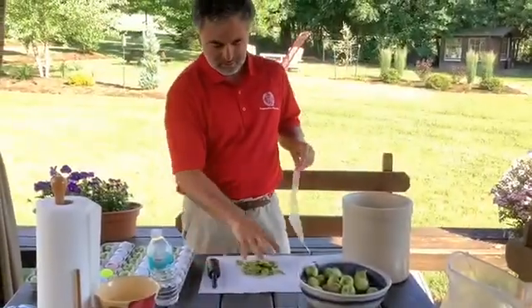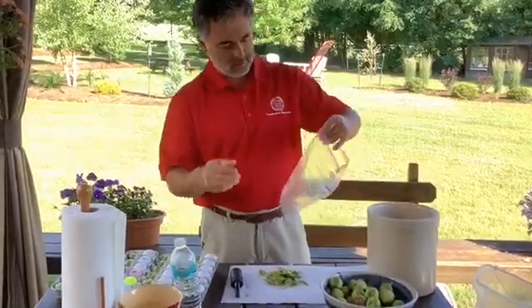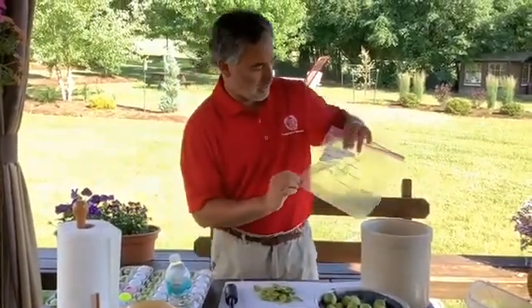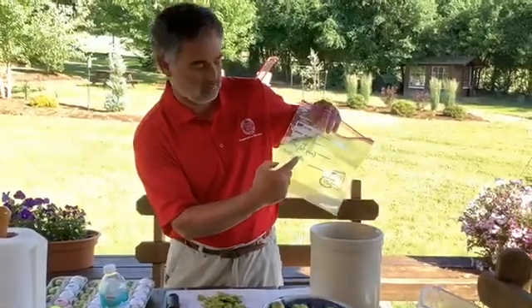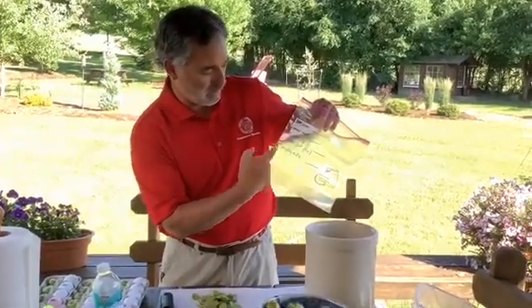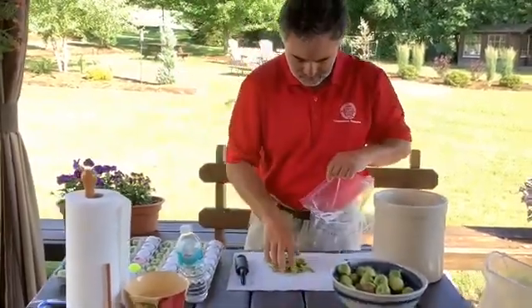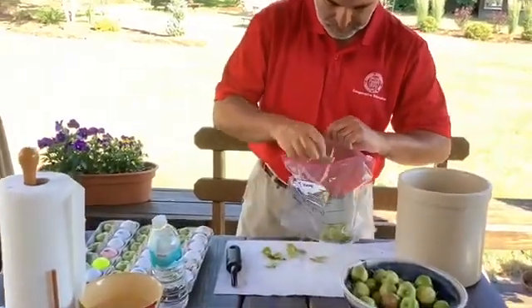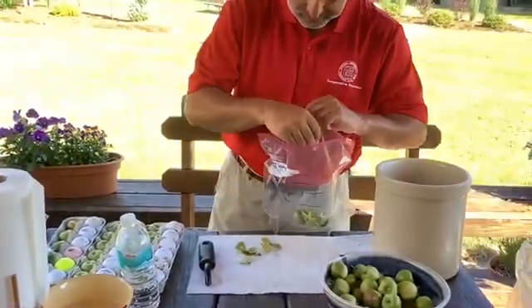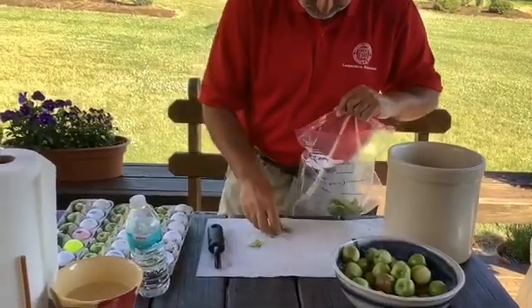I had the peel here, it took me less than 2-3 minutes, and in this storage bag where you have the farm name, grower name, contact information, your cell phone, your email, and the sampling day of the fruitlets, what you do now is take the peels and put your 60 pieces of peel in the bag.